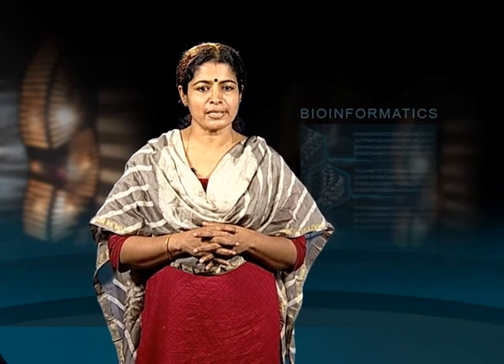After purification, the DNA is released from the TF, amplified, labeled and hybridized to the array. This technique is commonly referred to as ChIP-chip, for chromatin immunoprecipitation on a chip or microarray. The TFs often bind quite a distance away from the genes that they regulate. The design of the array and the size distribution of the fragment length are interrelated.